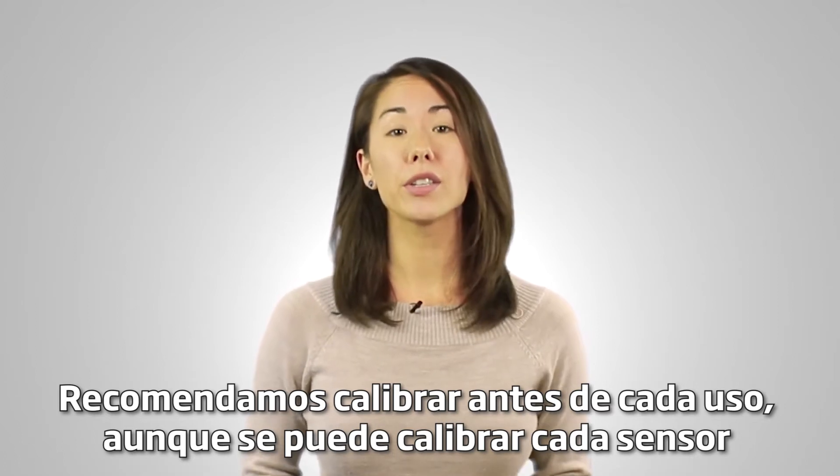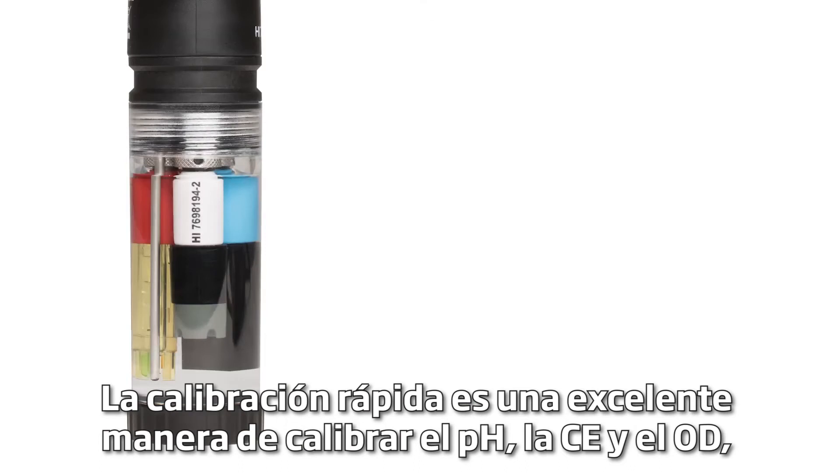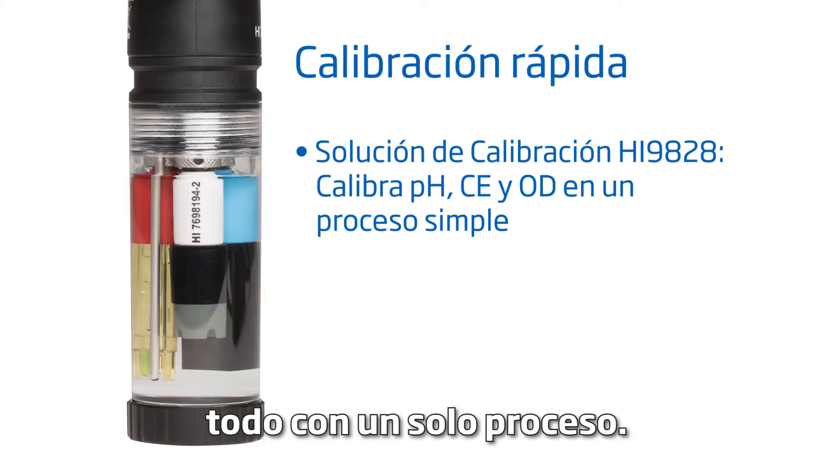Although you can calibrate each sensor individually, in this video we'll do a quick calibration. Quick calibration is a great way to calibrate for pH, EC, and DO all with one process.